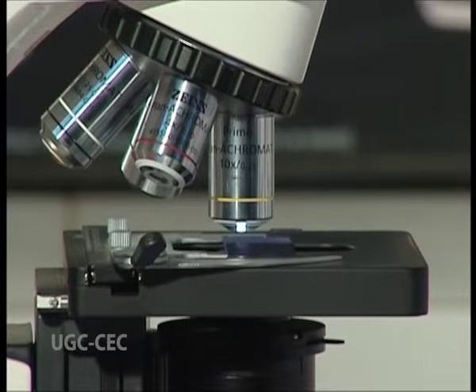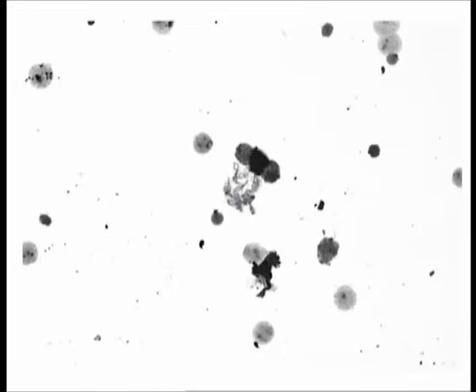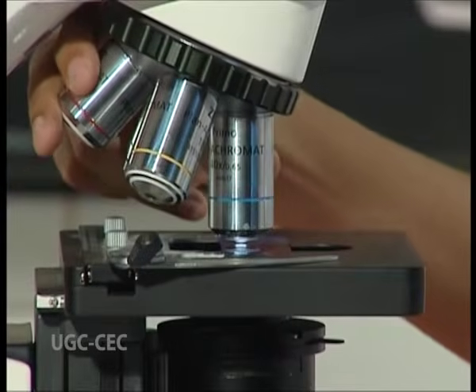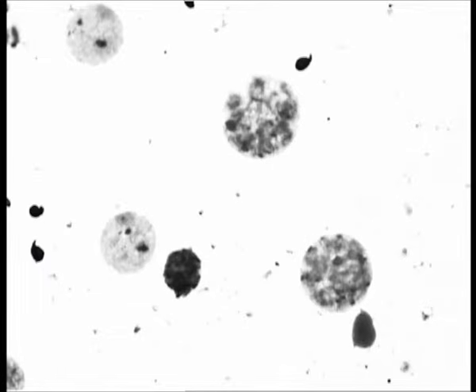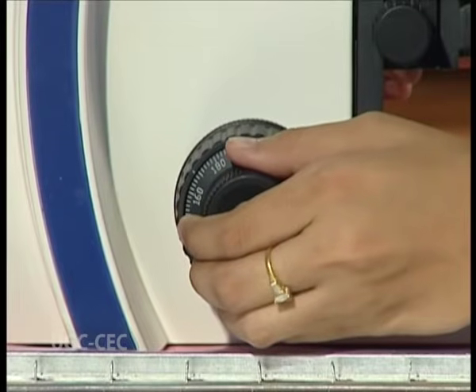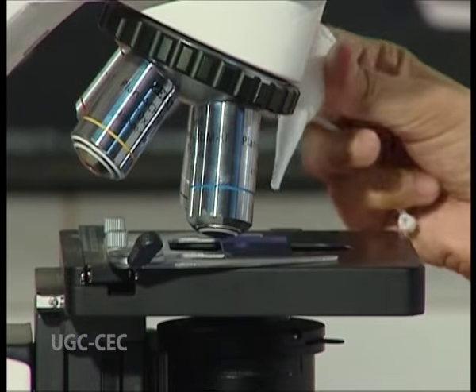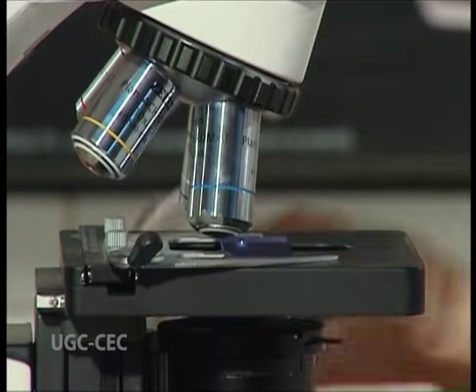Observe the slides first under low power. Check various fields to observe different phases. Different stages of meiosis can be observed under high power for better visualization. If required, the cells can also be observed under oil immersion lens.